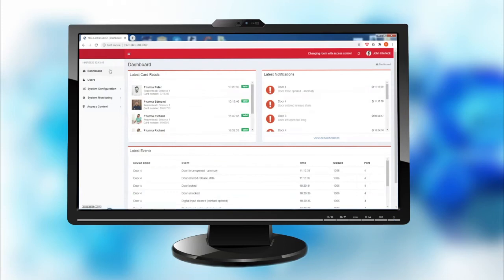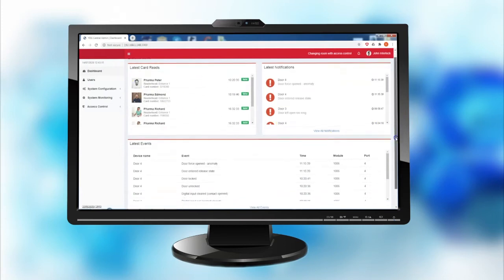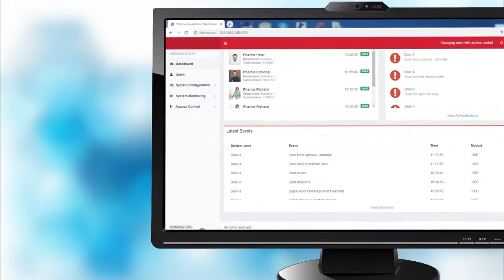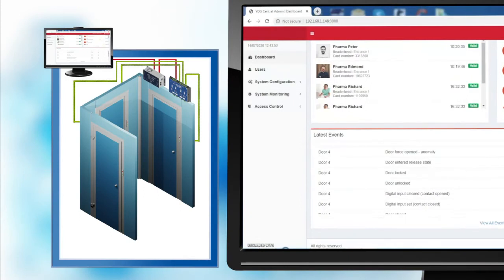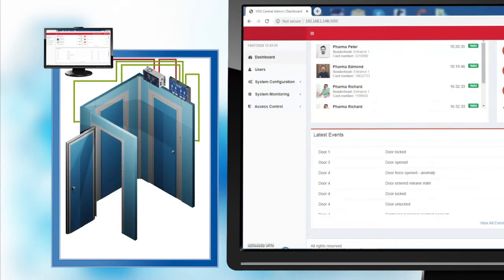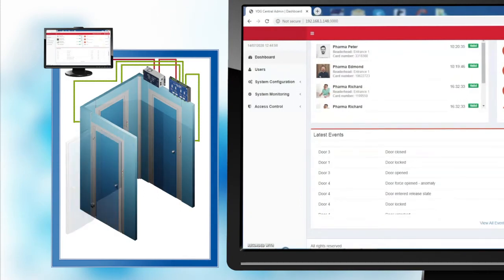The dashboard is the surface where all events are shown in real time, such as which door is open, locked, unlocked, or closed.